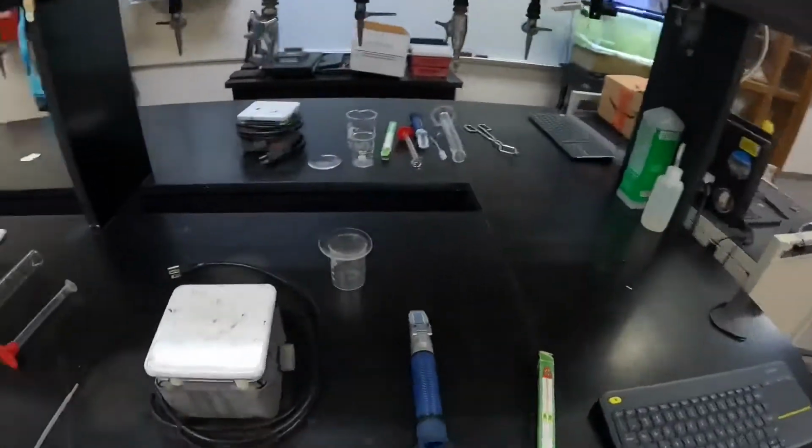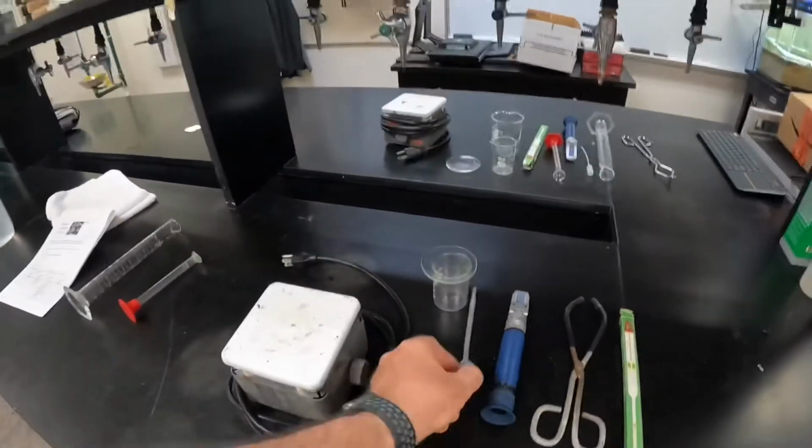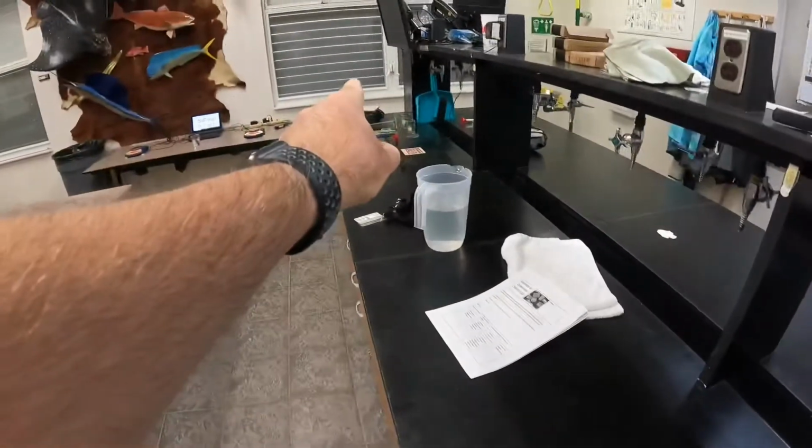When you're done collecting your data, make sure you clean up the lab space. Take these and wash these in the sink at the end of the lab counter down there, and make sure your lab area is dry. That's all there is to it.